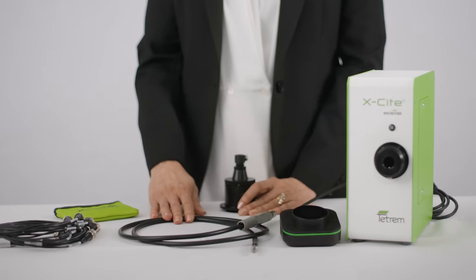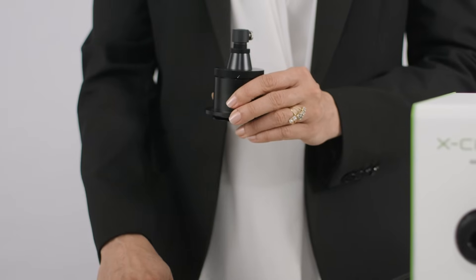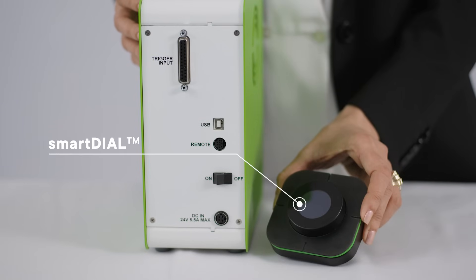TETRUM delivers light to your microscope through a standard 3mm EXCITE light guide via an adapter. As with all EXCITEs, the adapters are designed optimally for each microscope light train. TETRUM can be controlled via TTL, USB, and manually via the new EXCITE smart dial controller.